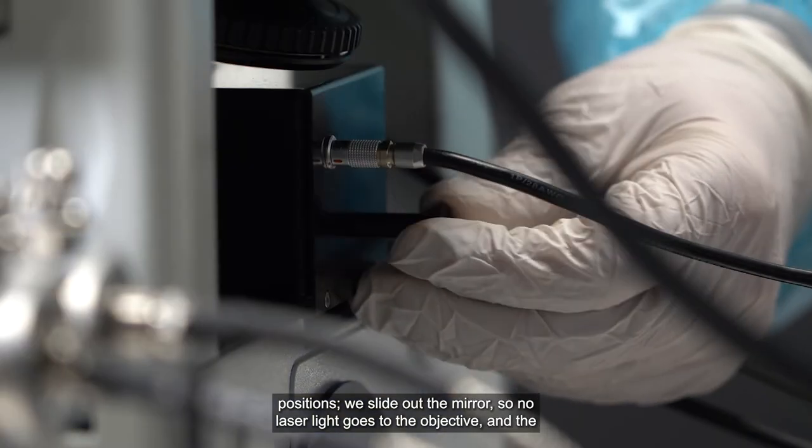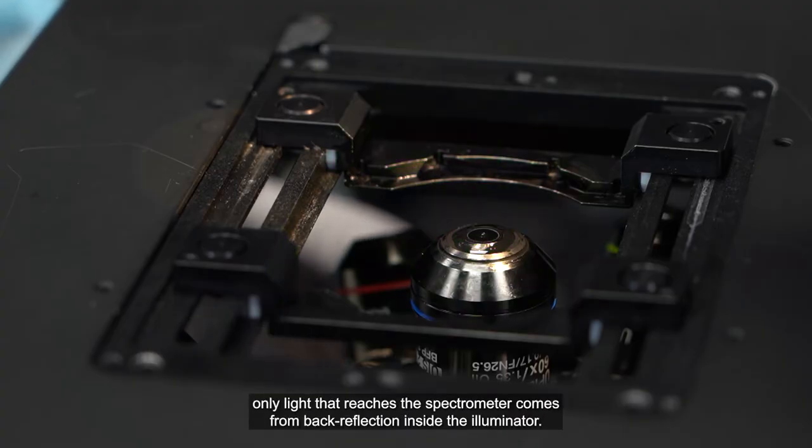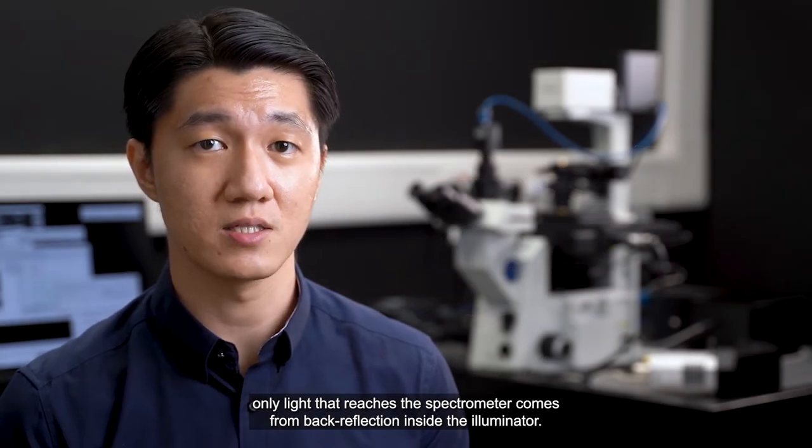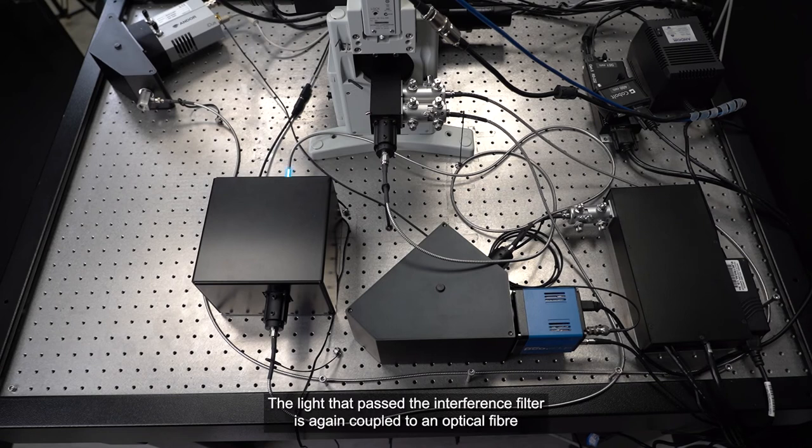We slide out the mirror, so no light goes to the objective, and the only light that reaches the spectrometer comes from back-reflection inside the illuminator. The light that passes the interference filter is again coupled to an optical fiber, and delivered to a Brillouin spectrometer based on VIPA.